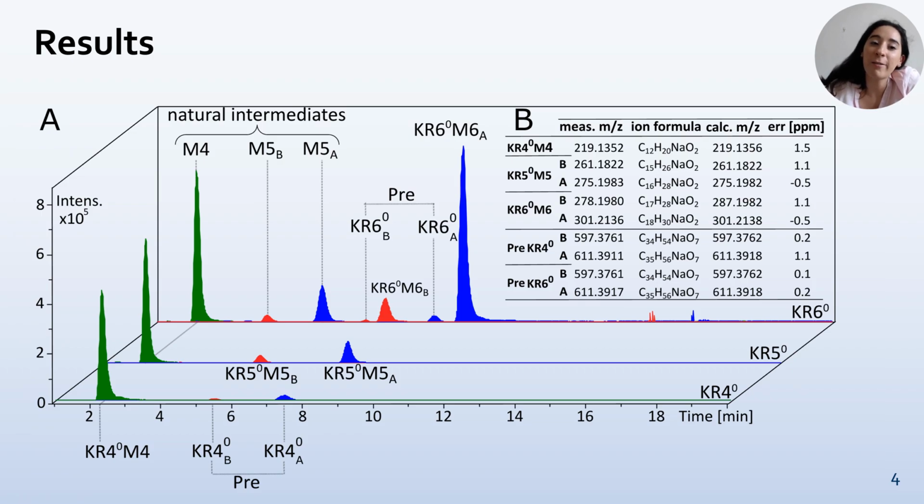We created a library of monensin derivatives by making targeted mutations on the different ketoreductase modules. We did a targeted approach, so we did the extraction of key intermediates of the monensin biosynthesis, and we analyzed them via LC-MS. We found out that there was an accumulation of the biosynthetic intermediates in the mutated module and downstream. This shows that the reduced catalytic efficiency and the drop in yield is due to a substrate specificity in downstream modules. In other words, targeted metabolomics seems to be a great way to identify bottlenecks in different mutated strains.